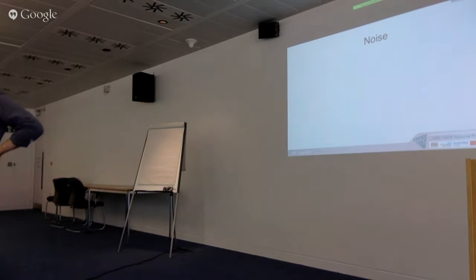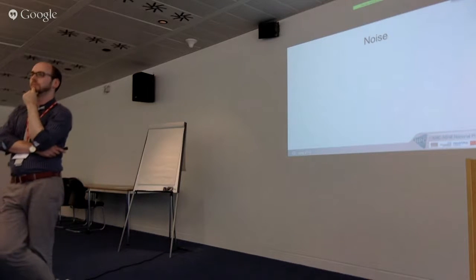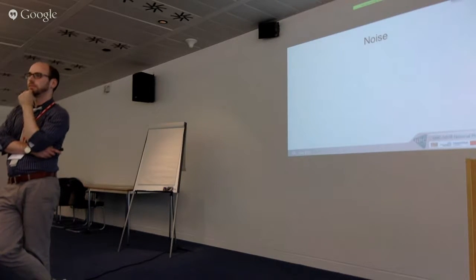Can I just ask, and this is someone coming from outside this domain, I don't know at all much about the data type and methods, but it strikes me that there's an abstraction, so there's a computational process that takes you from continuum to a peak data set. Absolutely, it's big data reduction. But there's heterogeneity in the methods that are available. No one's finalized what necessarily good is, or there are genuine reasons for difference.